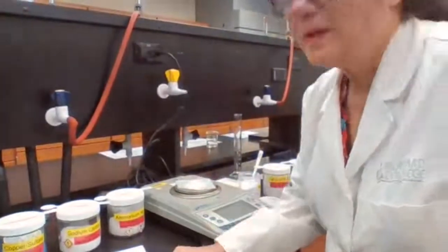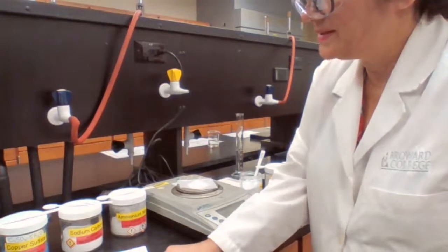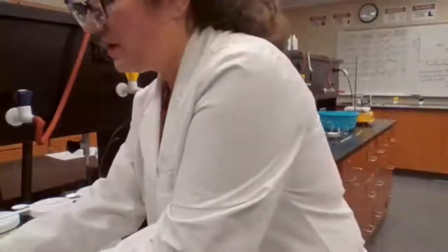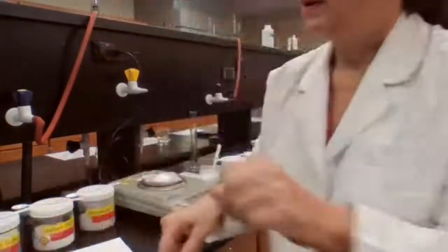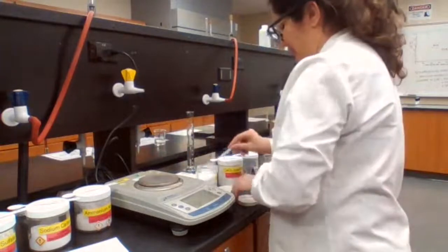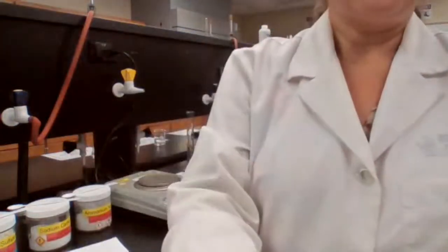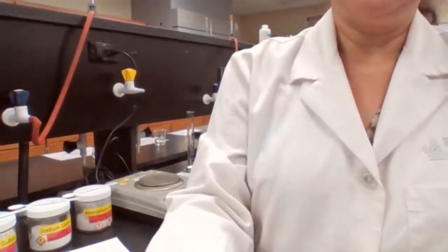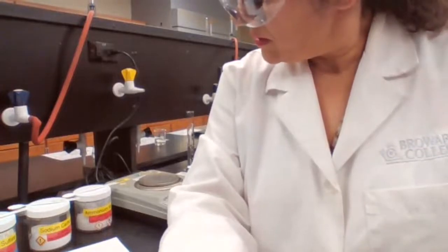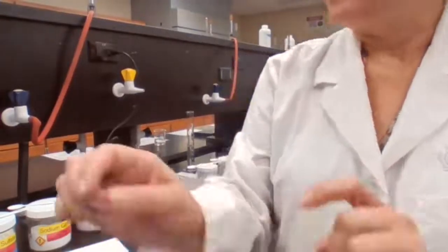So we measure the mass. The calcium chloride, before and after it sits out on the lab bench for 15 minutes. So we have the mass before. The mass before was 5 grams for the calcium chloride. Now I'm going to measure again. That's like after. So it was 5 grams before. We're going to record that. It's the 5 gram calcium chloride before, and measure the mass.